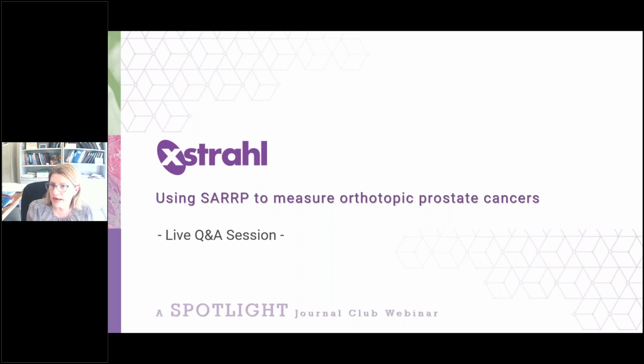Some of the GI might also be something that you could potentially monitor. We have not tried to do that yet, and we do have some GI cancer models. We're looking more at metastasis with that, which the IVIS does a better job than we can do with the CT. The CT will probably only be good for looking at primary tumors because we can't get to that small of a scale to see the small number of cells that are disseminating throughout the body.